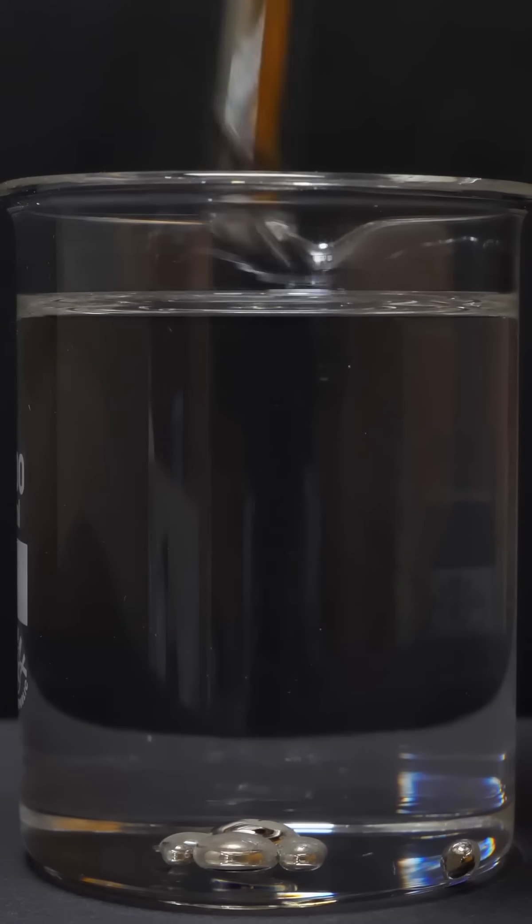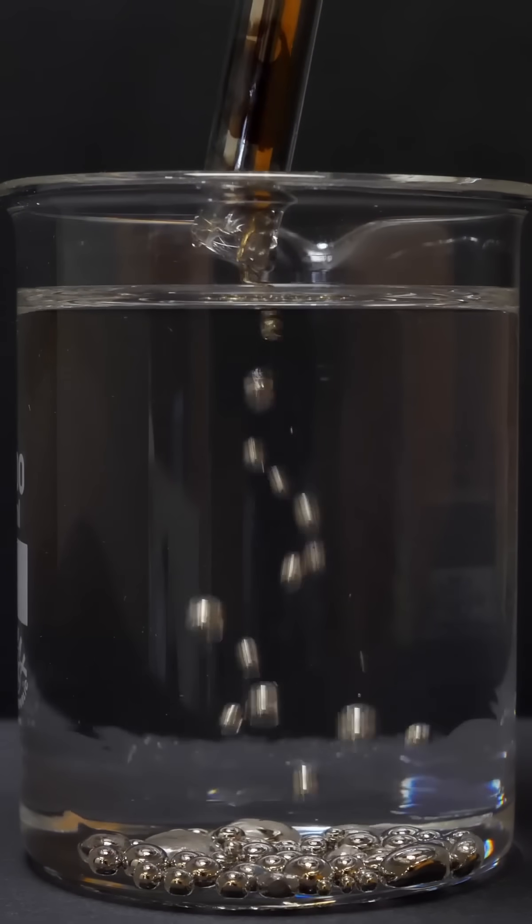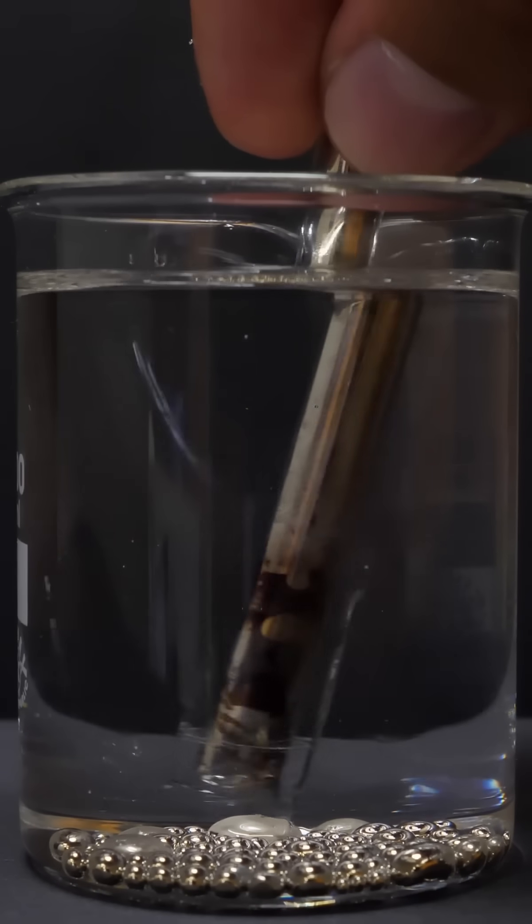Cesium melts at 28 degrees Celsius, so I can easily melt it with my hand. The sight of the cesium beads dropping from the ampoule into the oil is absolutely priceless to witness.